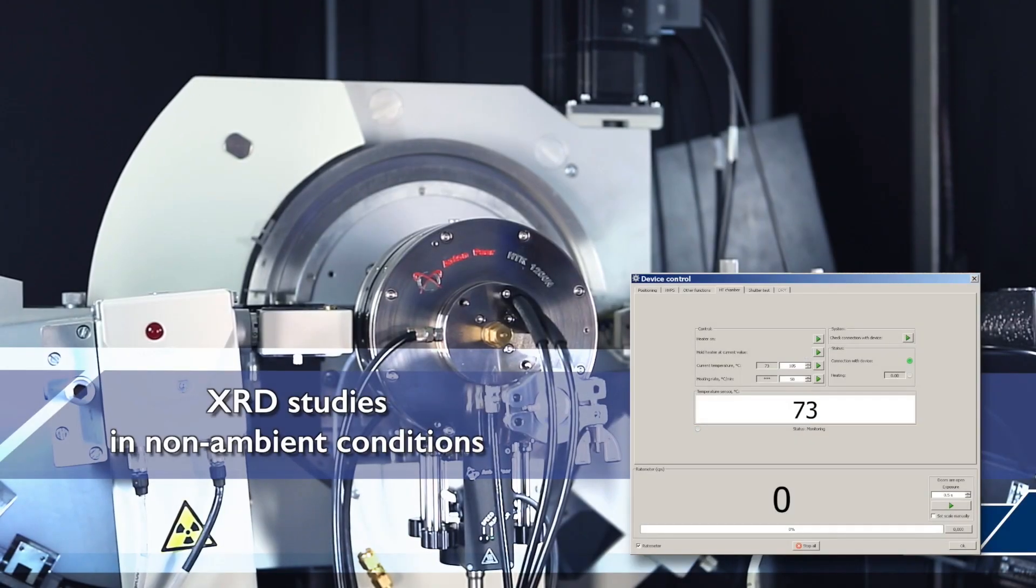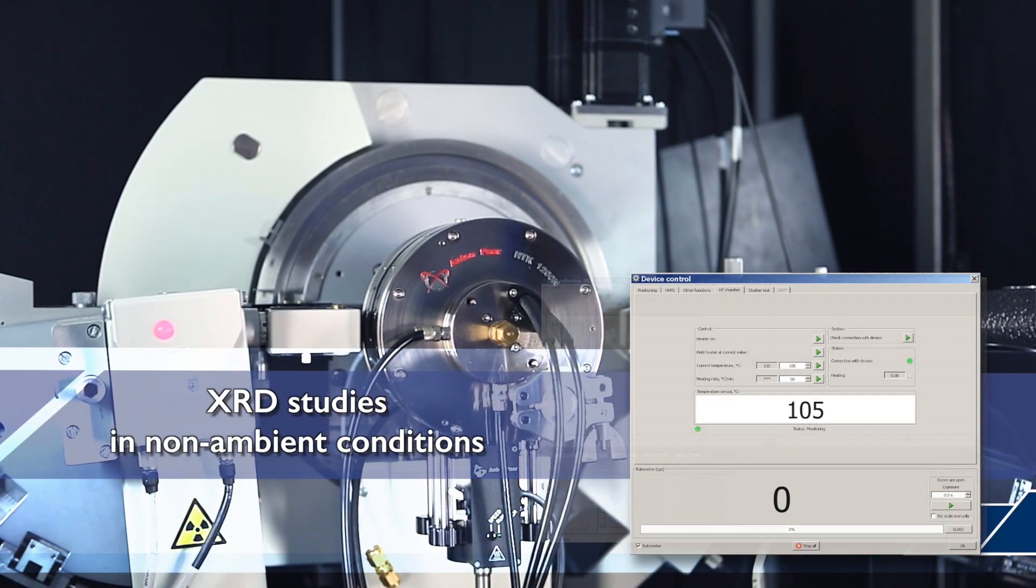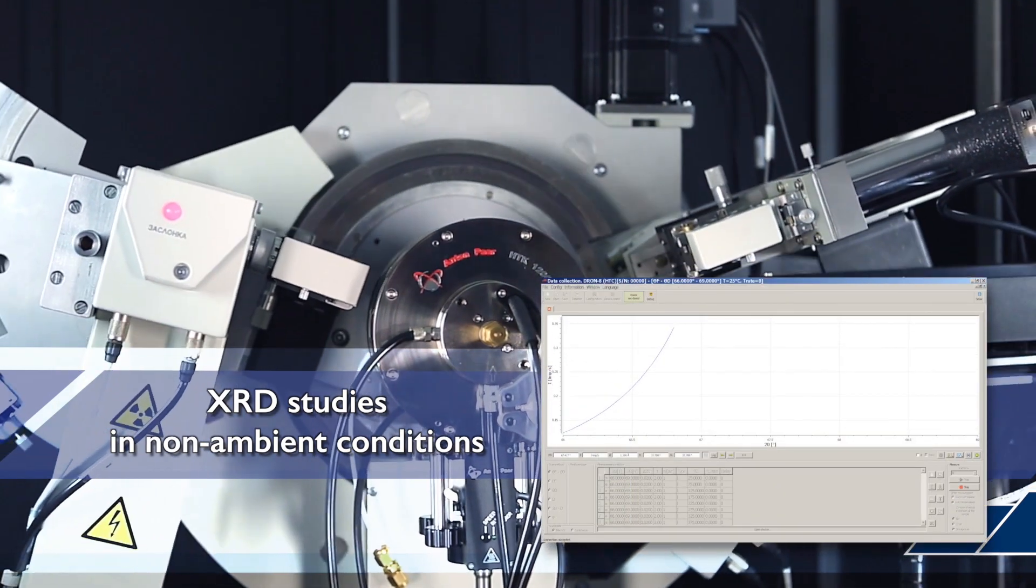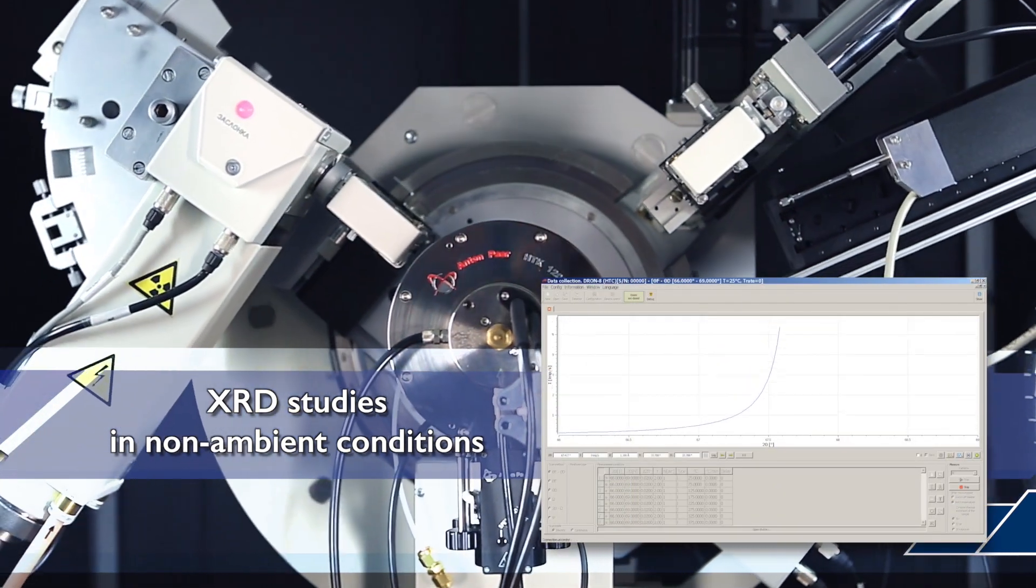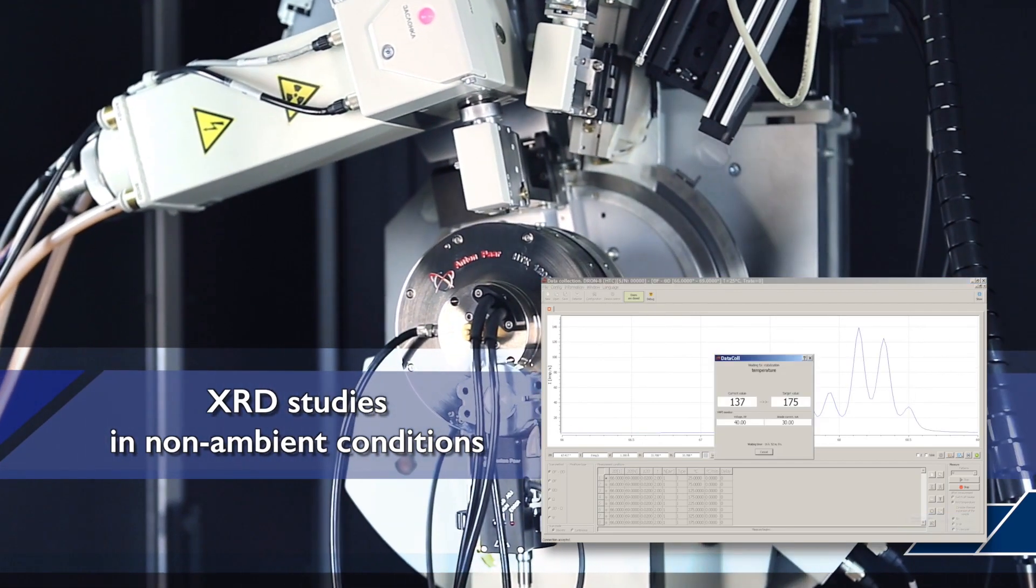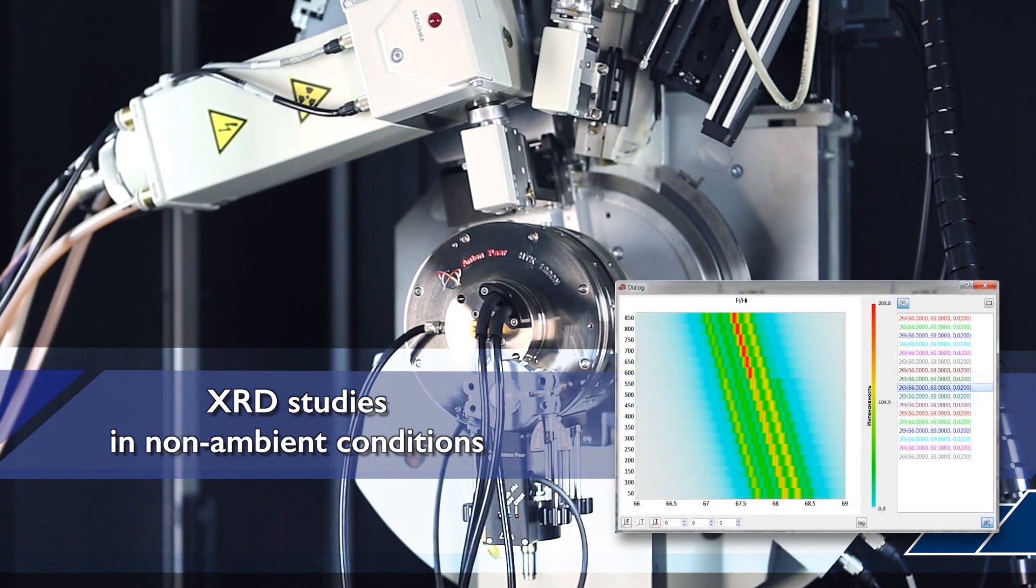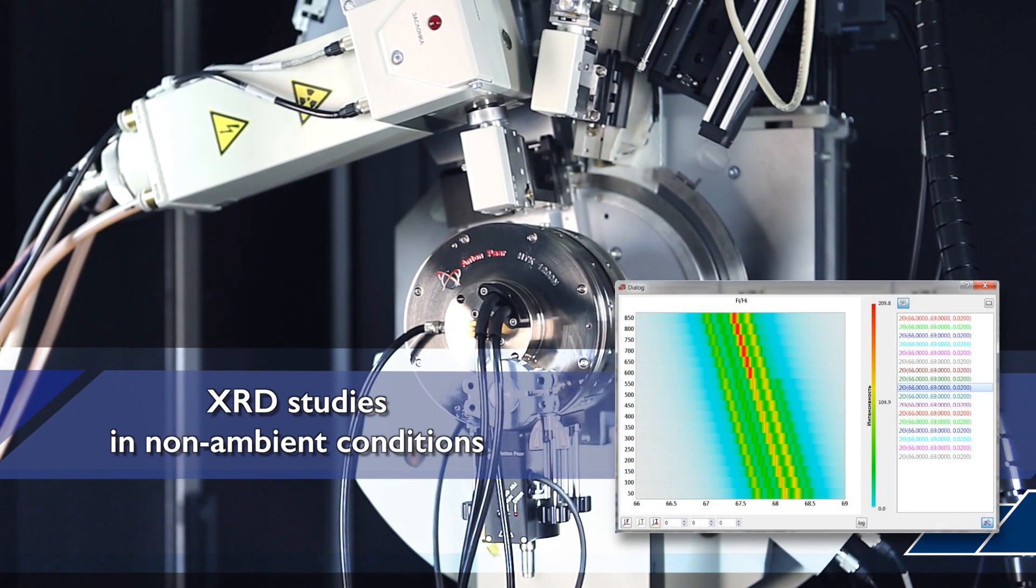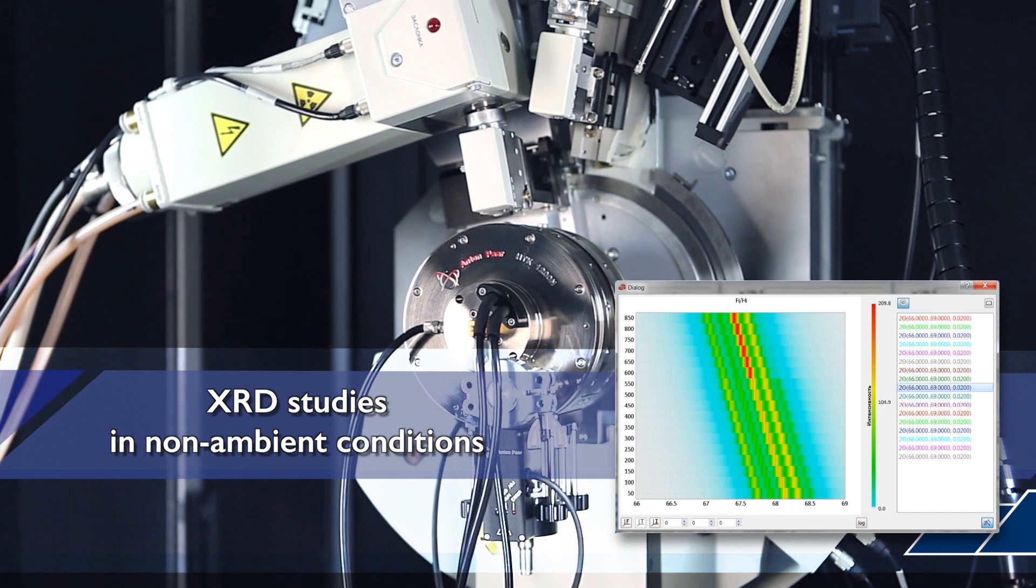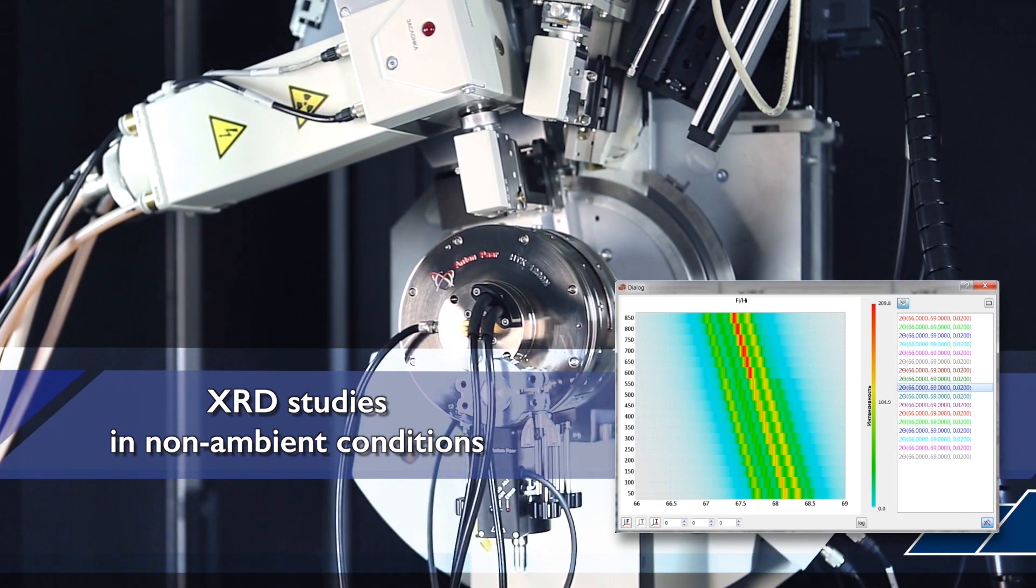Installation of different chambers to carry out measurements in non-ambient conditions enables in-situ studying of phase transitions, tracing structural transformations, recognizing chemical reactions, as well as analyzing thermal and other deformations of crystal lattice occurring at elevated or low temperatures, under vacuum or inert gases, under controlled humidity or mechanical load.